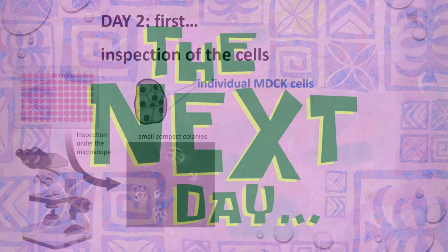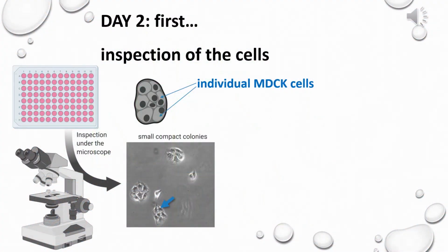The next day. Yo, welcome back to the lab. How did it go yesterday? Was everything fine with the cells and the counting? How did you manage? I think today we're going to find out, because let's take the plate out of the incubator, place it under the microscope and have a look at the wells.